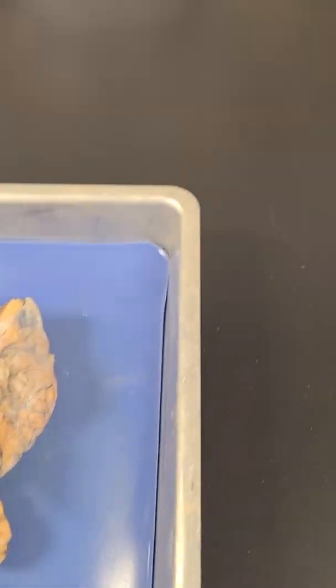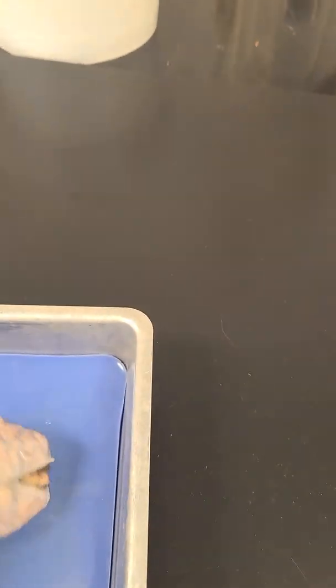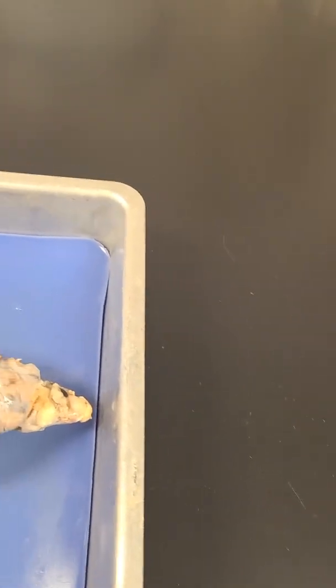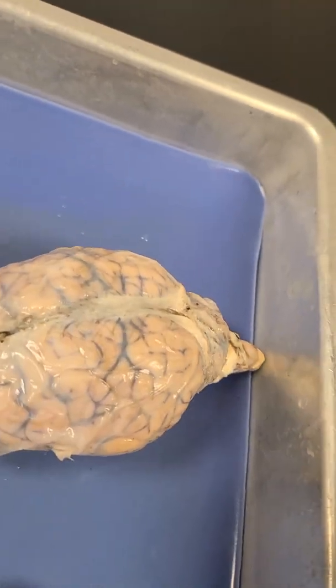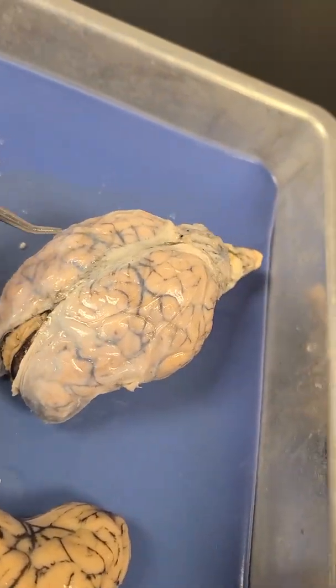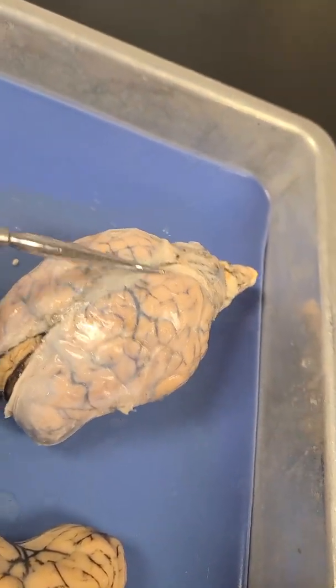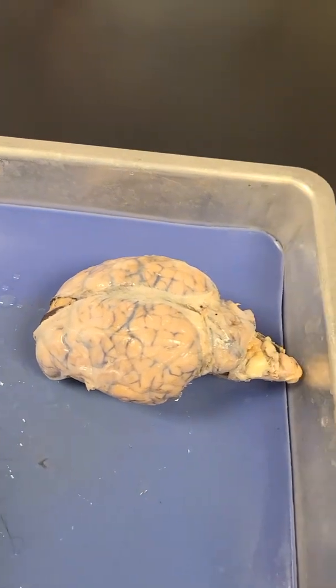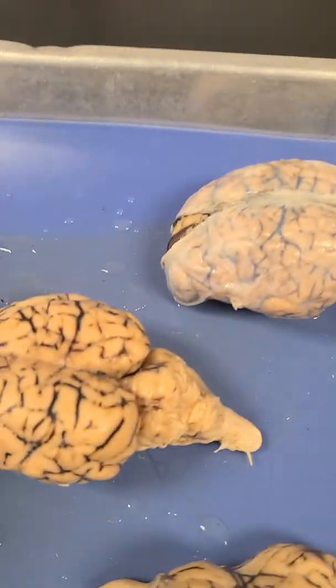The first one says the dura mater, and it's really just our meninges. So this is in the whole brain, and hopefully you can see this meningeal covering right here. It's clear, you can see underneath, but it's this whole clear covering over the whole brain. So when you're dissecting, that has to be removed. We'll take a look at that again in a second.